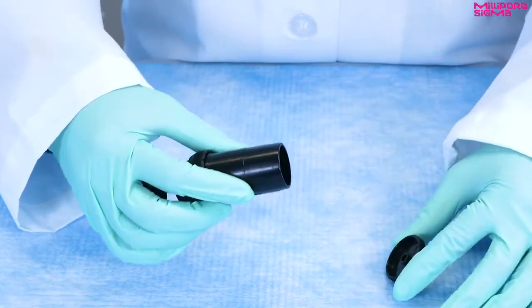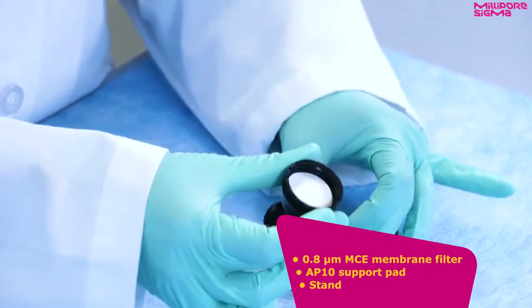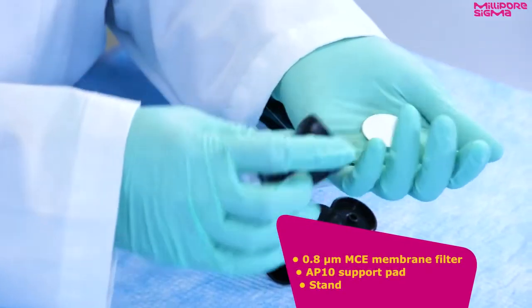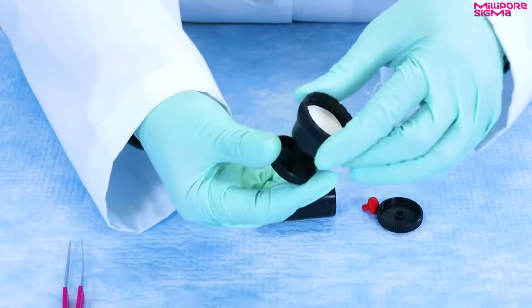The unit includes a center extension cowl. The bottom piece contains a 0.8 micron MCE membrane filter and an AP10 support pad. It also has a stand at the bottom.